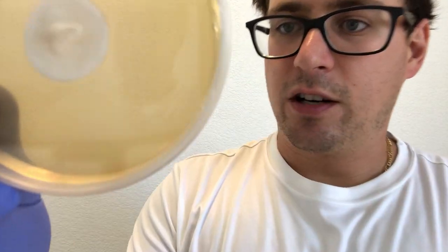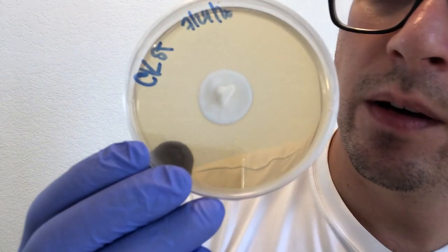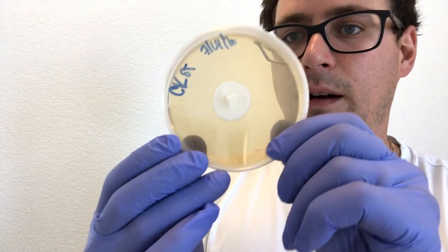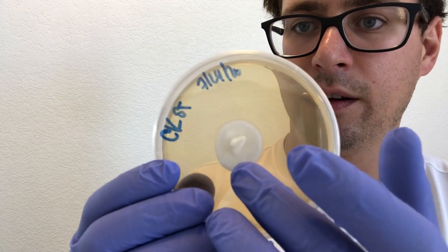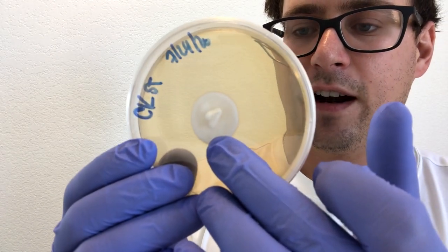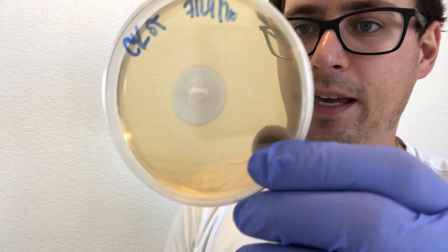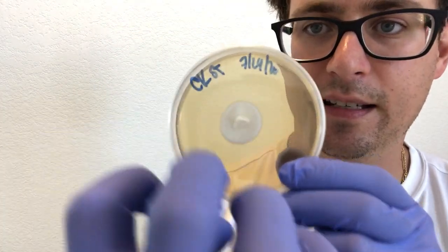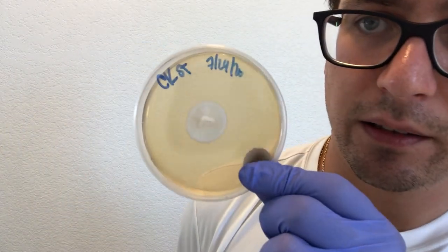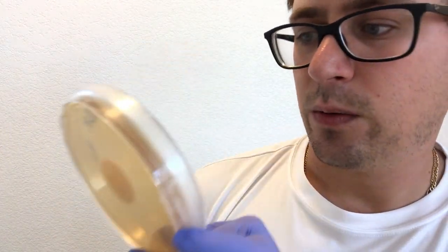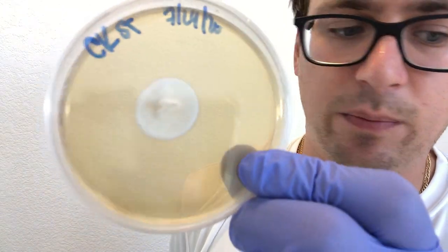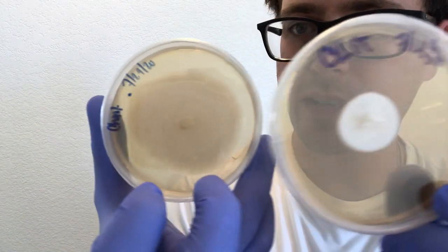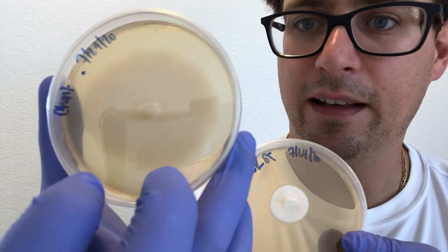Next is king stropharia. A different characteristic that I try to select for is the speed of growth. King stropharia is usually pretty slow on MEA, but you can see it's nice and dense and white and healthy. This one was inoculated 7/24, so this is a couple weeks of growth. You can see it's pretty slow compared to this chanterelle that's already taken over the plate, and this was inoculated five days after this one.